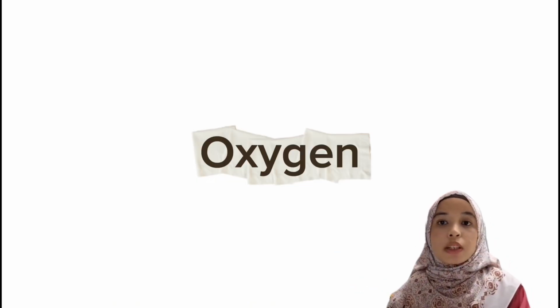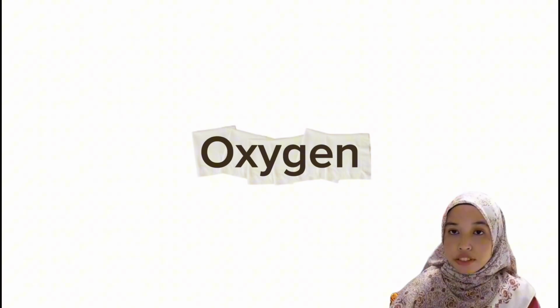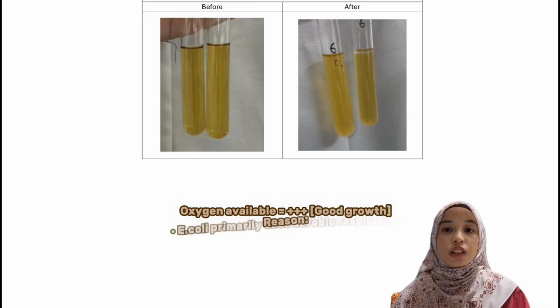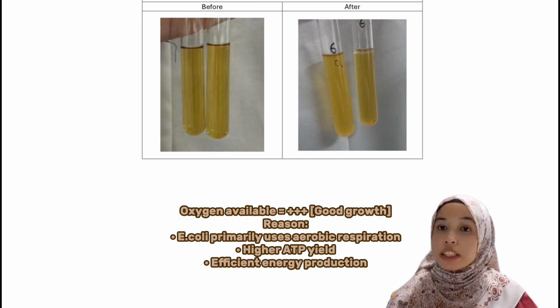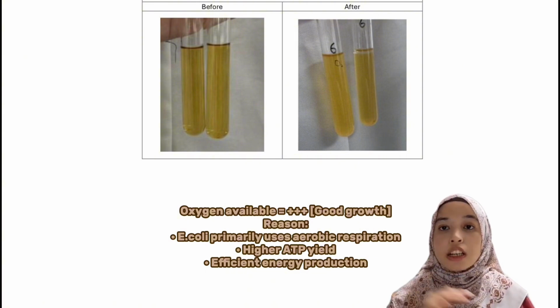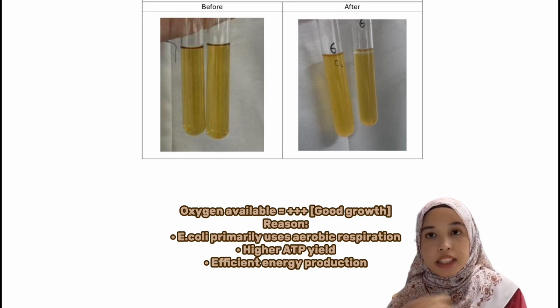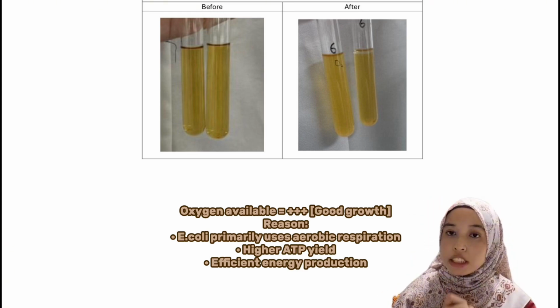Lastly, we will discuss the E. coli growth in the presence of oxygen or when there is no oxygen available. When there is oxygen available, E. coli has good growth because E. coli primarily uses aerobic respiration. Thus, it has higher activity and efficient energy production.